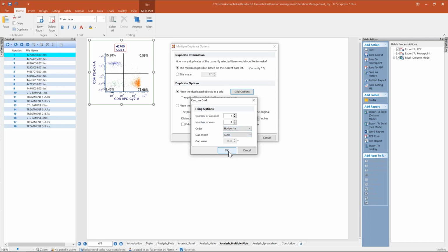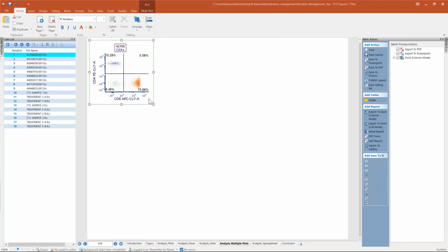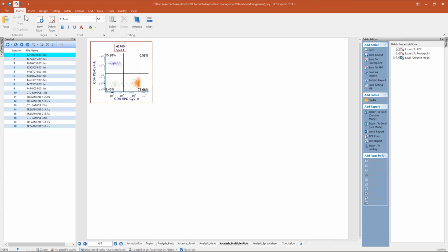And I think I saw something about the axes changing. So if you don't fix your axes for a bi-exponential plot, it will change according to each data file, depending on which data file is being displayed. So that does occur sometimes, but you can fix the scaling if you would like.